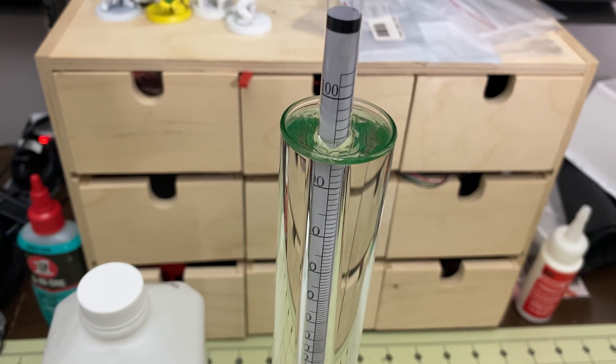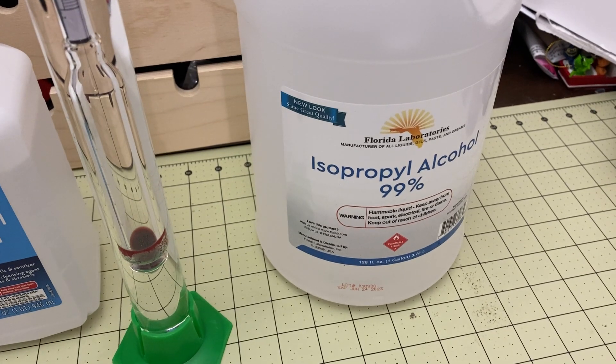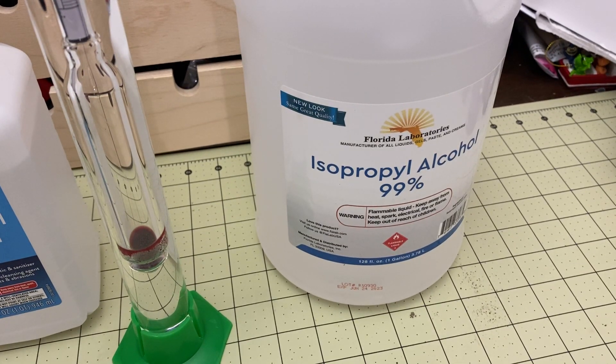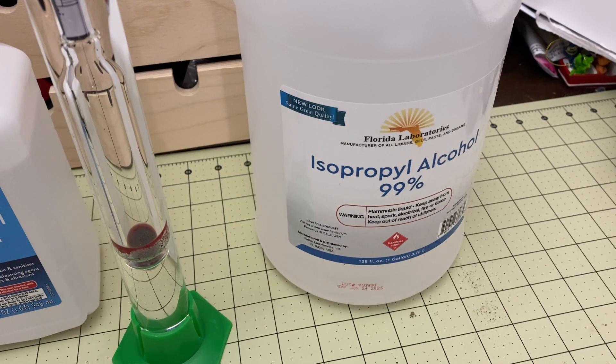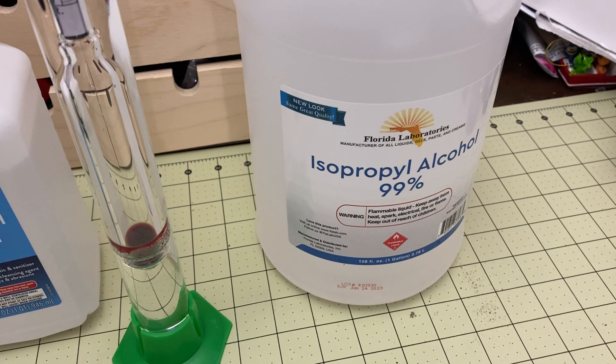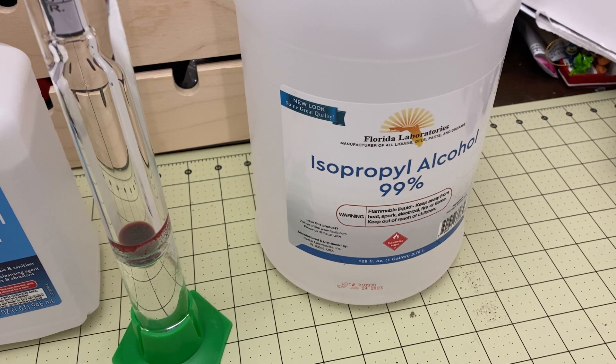I think that's fairly conclusive that the Florida Laboratories 99% IPA is the real deal. This will only be available to people in the United States, sorry if you're international. It's pretty inexpensive, and importantly it doesn't smell like acetone — that's part of the reason I don't use acetone or distilled spirits. IPA doesn't smell nearly as bad as those alternatives, and this stuff works great and is actually what it says it is.